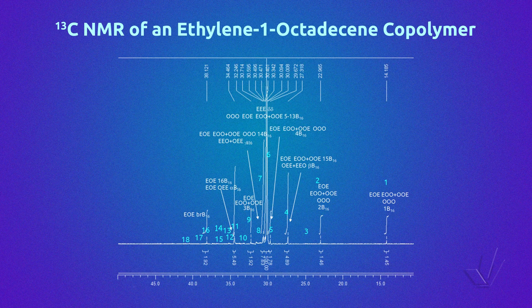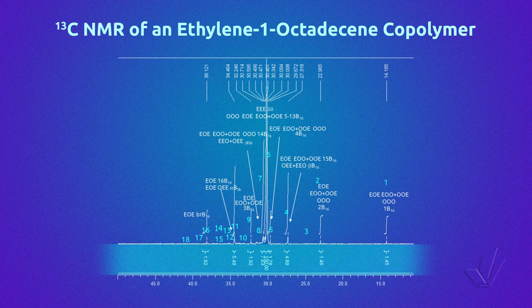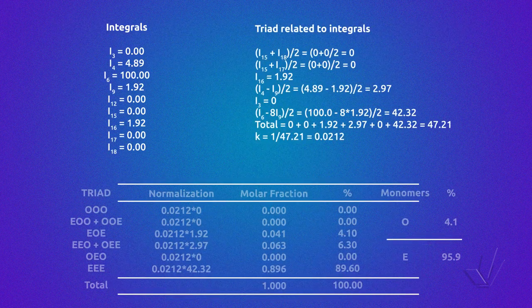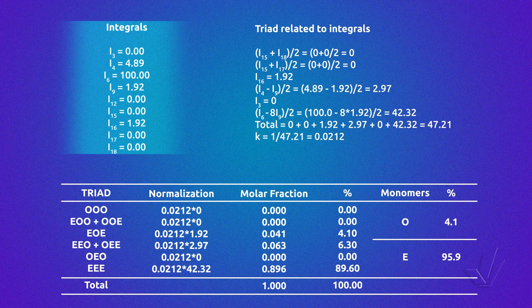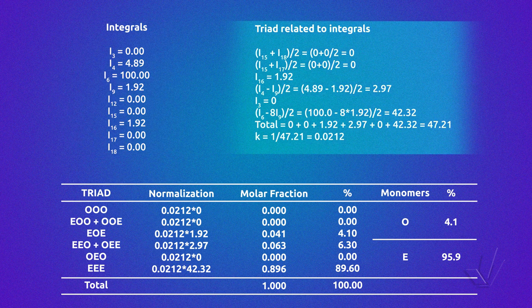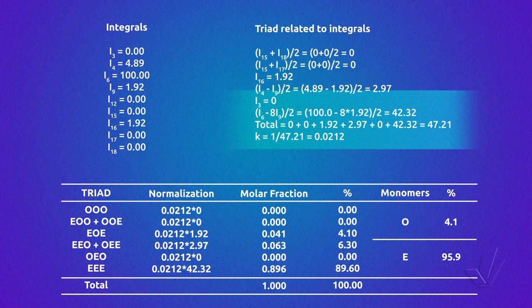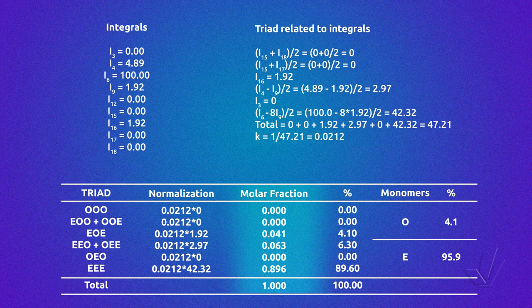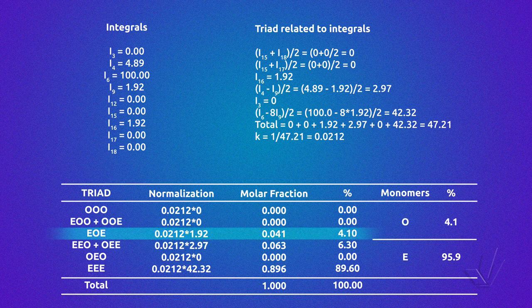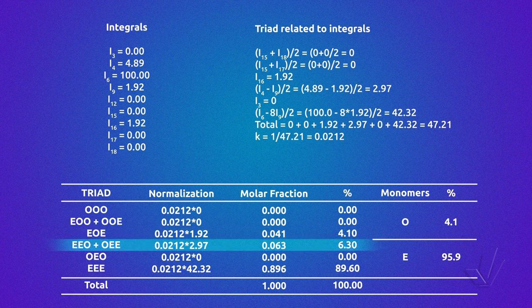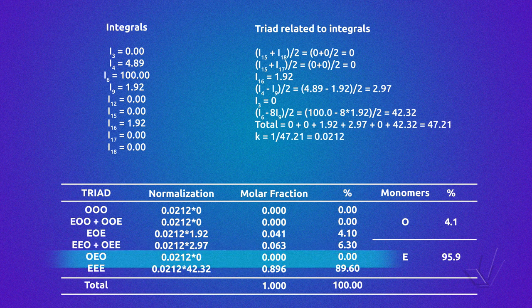Here we have an example of an ethylene-1-octadecene carbon-13 NMR spectrum. The 18 peaks of the table have been located at the positions of the possible peaks, shown in blue. As we can see, not all the peaks are present. We have the integral of each peak at the bottom of the spectrum. We take all the peak integrals needed according to the previous equations, then introduce the integral values in the triad equations, and normalize by adding all the values and multiplying by the normalization constant to obtain the triad percentages. This copolymer has 4.1% of triads E-O-E, 6.3% of triads E-E-O plus O-E-E, and 89.6% of triads E-E-E.